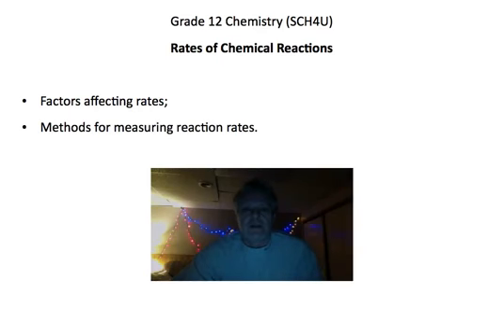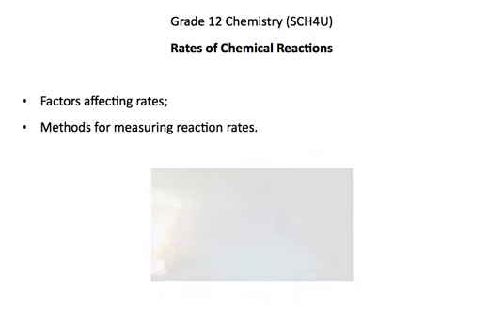This video is going to show you a few demonstrations of how we can affect or alter the rate of reaction. Again, I think a lot of this is probably somewhat intuitive, and I suspect you've experienced this before anyway, so I don't think there's going to be anything too new here. The last thing I'll mention quickly is some means that you can use to measure the necessary variables that allow you to calculate a rate of reaction. So why don't we get started right away.